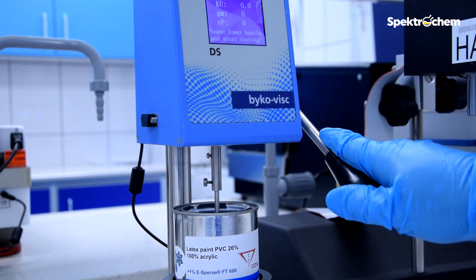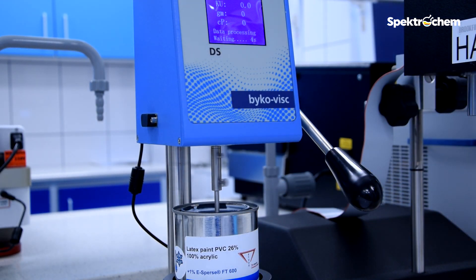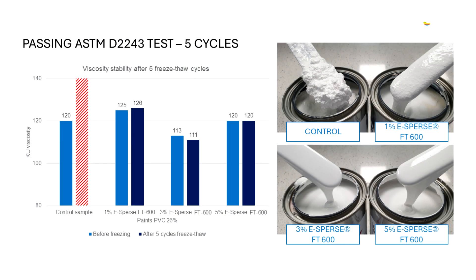After assessing the paint sample on the spatula, it's time to measure viscosity changes using a Stormer viscometer. The graph shows that samples with ESPERS FT600 show no viscosity drift after 5 freeze and thaw cycles. The control sample has an out-of-scale viscosity.